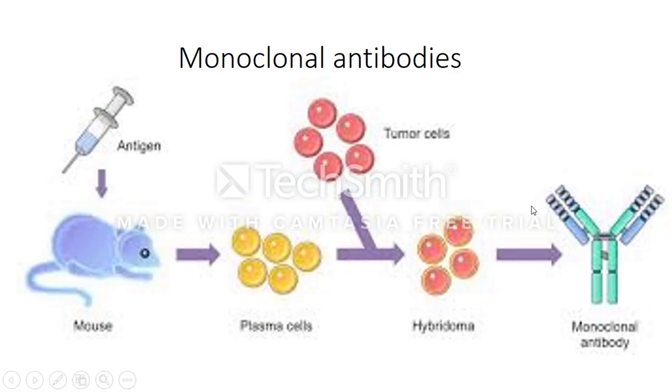You might be wondering, why don't we just use one antibody and attach the fluorochrome to this primary antibody? Well, it's really expensive, and we might want to use this antibody for something else because it attaches perfectly. And obviously this entire process is very costly because look at how many steps you have to go through, and look how long this would take because you're using one specific organism.